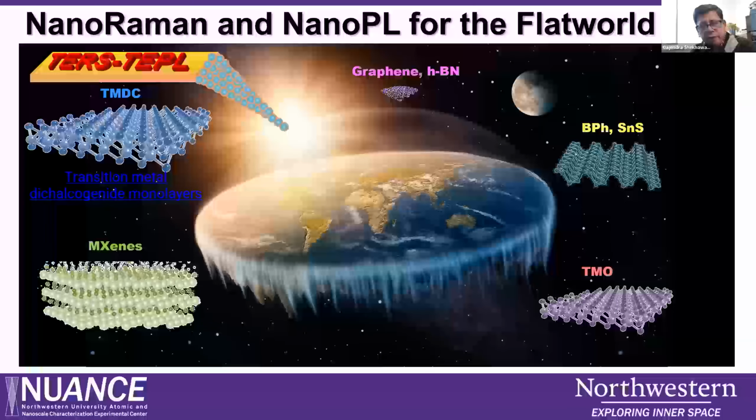The whole idea behind this TERS is that it is mostly applied to 1D and 2D materials, because they are pretty thin. There are different categories of these materials within this group. One of the unfortunate things is that it cannot be applied to pretty thick samples like polymers or pretty thick coatings and all those things. You need a pretty fine gold or silver coating on the substrate to enhance that surface plasmon resonance.